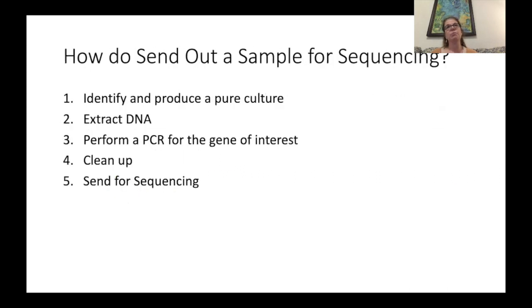So the general steps, and again, you're not going to be in the lab, so I'm going to talk about the general steps you're going to use, but you're not going to actually have the opportunity to do them this year, unfortunately. So we start with a pure culture of the organism of interest, and you guys are going to receive an unknown sample. So it's a pure culture of a bacteria that we know what it is, but you would not necessarily know. And that would have been something that would be prepared by the TAs.